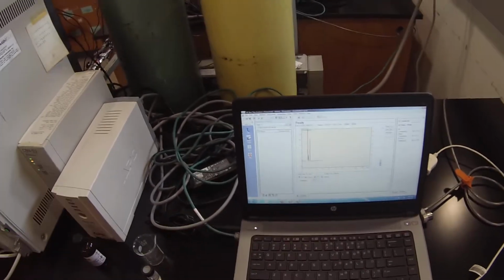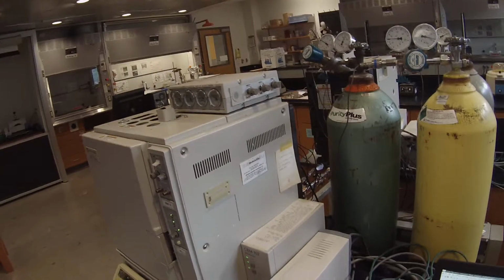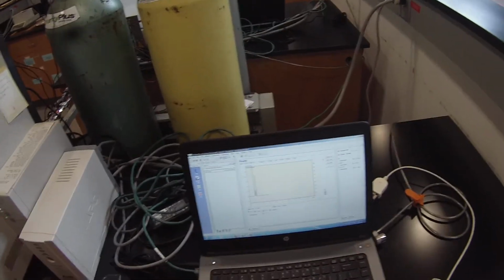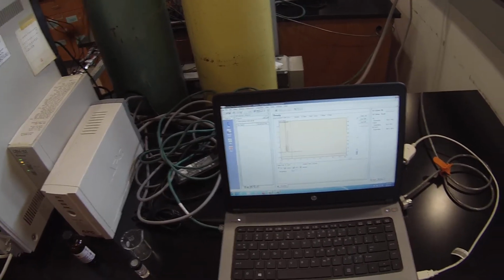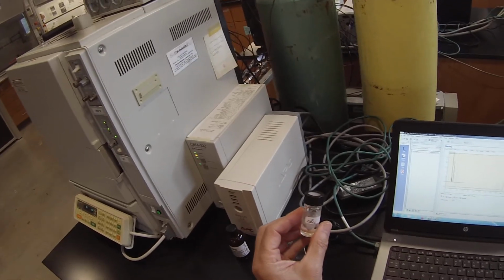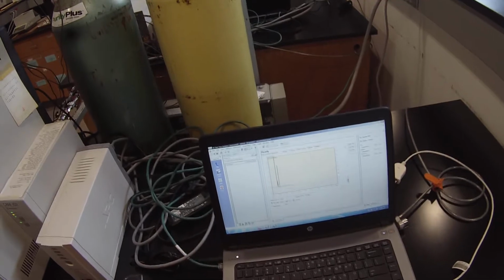Like I said, from year to year the pressures change, and so the pressure in the cylinder changes. So even though we have it set at 90 kilopascals, the flow rate may be varying. So I'm not entirely certain exactly what I'm looking at on the data there.